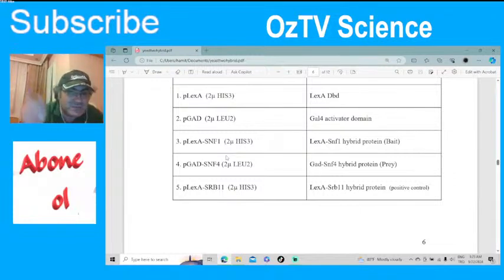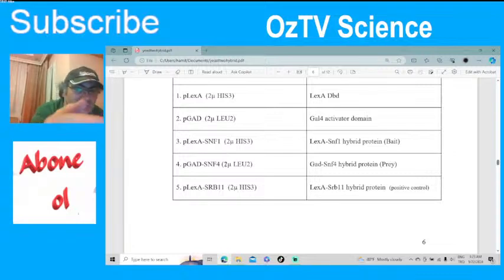That's the question. We're trying to test if these two proteins, SNF1 and SNF4, which we got from a DNA library, come together. What do they do? Does SNF1 make a complex with SNF4? We don't know.